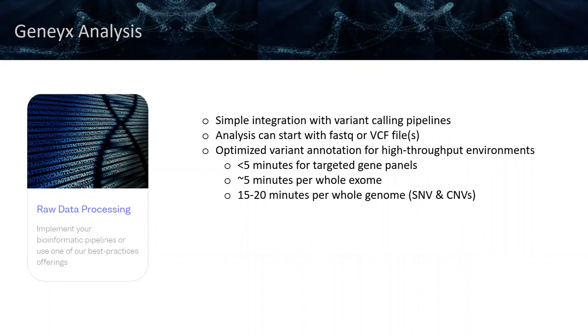But one of the great utilities of the software is that we've really tried to optimize the variant annotation, especially for high throughput environments.